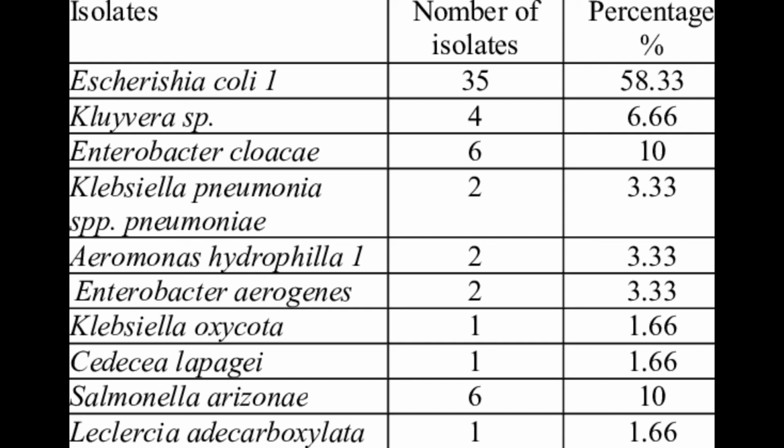So, lysine decarboxylation is read where? In the butt, an anaerobic process, while lysine deamination is read in the slant, which is an aerobic process. For lysine decarboxylation, the positive is purple, because the enteric acts on lysine and produces cadaverine, which is alkaline. The butt turns yellow on incubation, but if cadaverine is produced, the butt will revert to purple. That is why it usually has a light yellow tinge because of the acid from glucose, not bright yellow anymore because of the cadaverine produced.